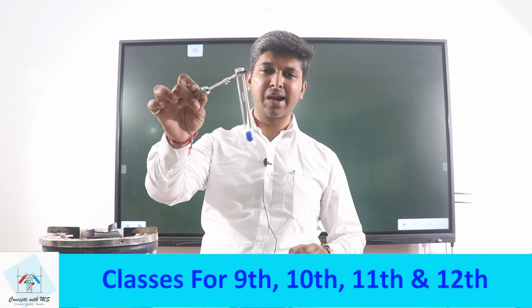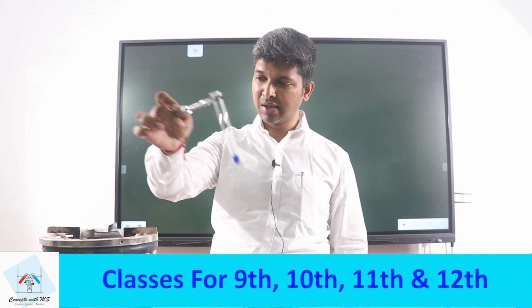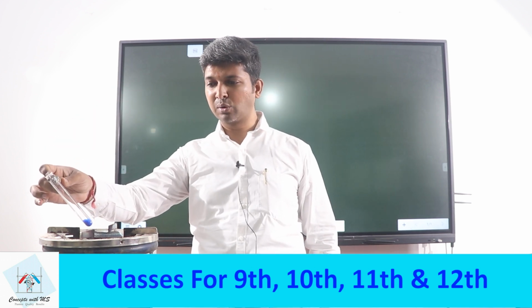So friends, today we are going to study about practical chemistry. We are going to heat a few salts and see the effect of heat, which is important in analytical chemistry and practical chemistry. We're going to see the effect of heat first on copper nitrate. These blue colored sparkling crystals are of copper nitrate. Let us see the effect of heat on copper nitrate.